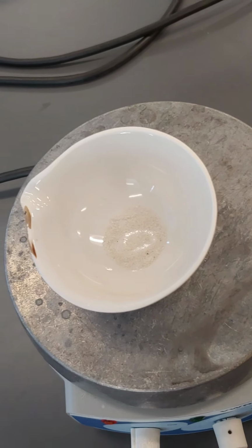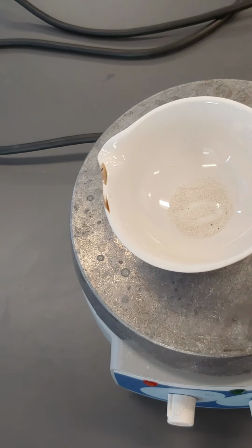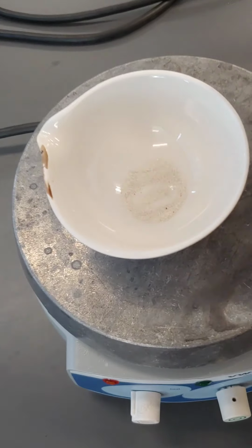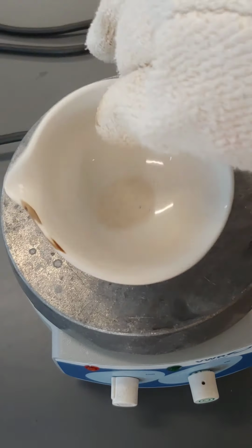And then if I were to grab the end of the dish, I'm trying to get my glove on here, and grab the end of the dish, you can see how the sand flows a little easier, slides around in there. So those are indications that it's not wet, it's not sticking together. So we'll give it a couple more minutes until it's completely dry.